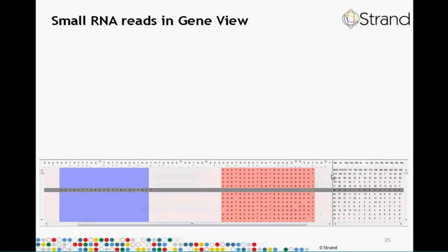So if we take a closer look, the very first read sequence starting with CAG-TGC and ending with CAT, there are 2,639 occurrences of that particular read sequence in the first sample. There are 1,272 occurrences of that read sequence in the second sample, etc.